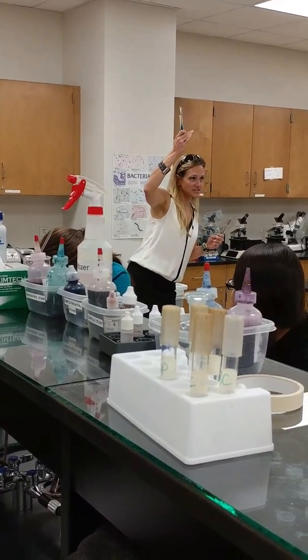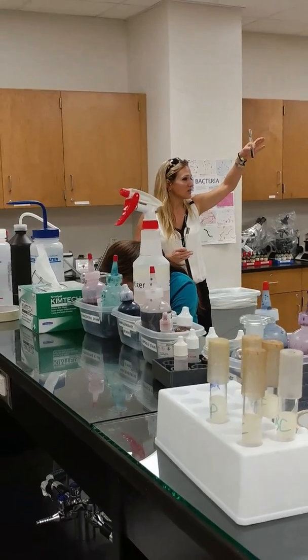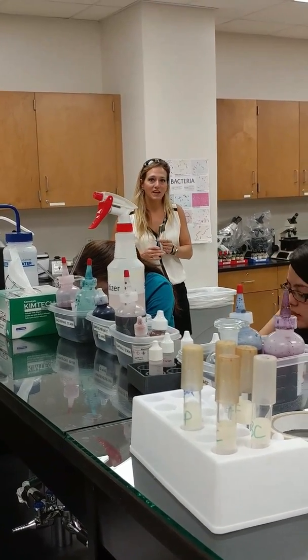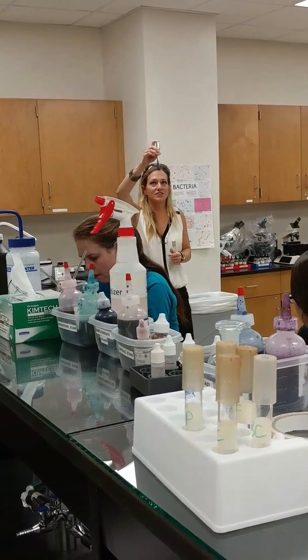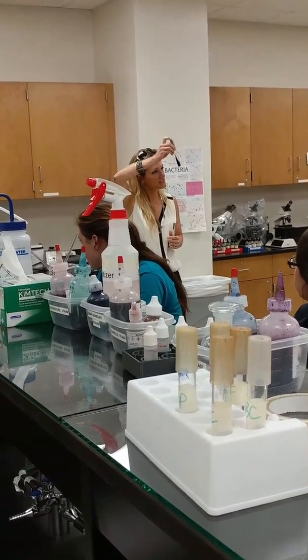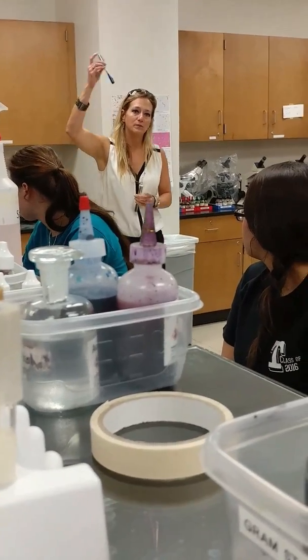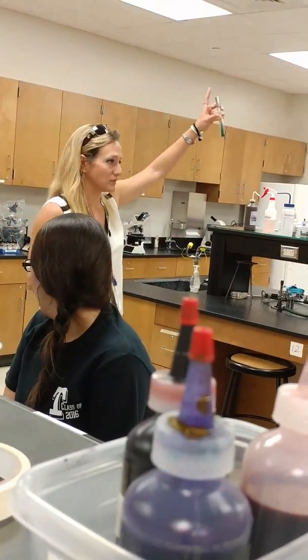It raises it, makes it more alkaline. Bromothymol blue at a neutral pH is this green color, but at a basic, higher pH, it turns into Caribbean blue. So a positive citrate test — meaning that organism can use citrate as a source of carbon — will be a pretty Caribbean blue, and a negative will remain green.